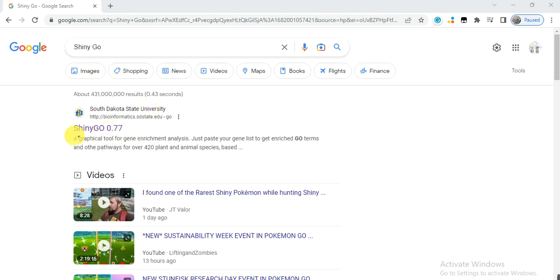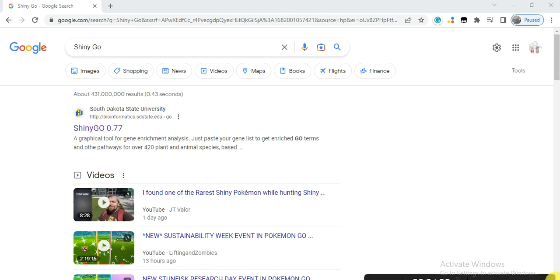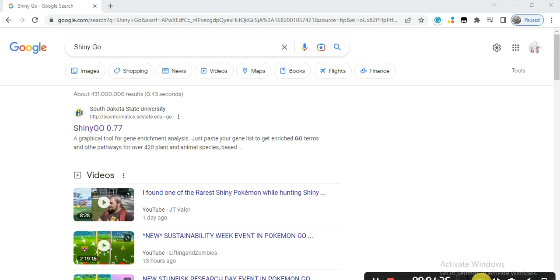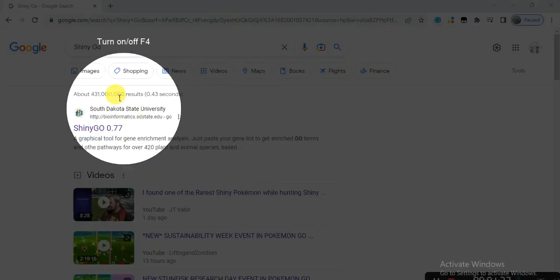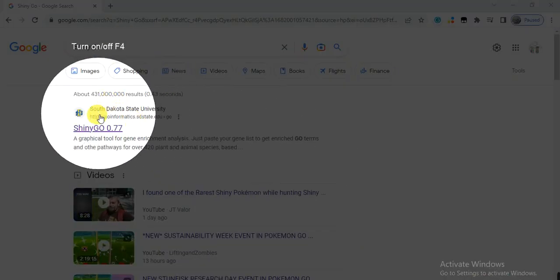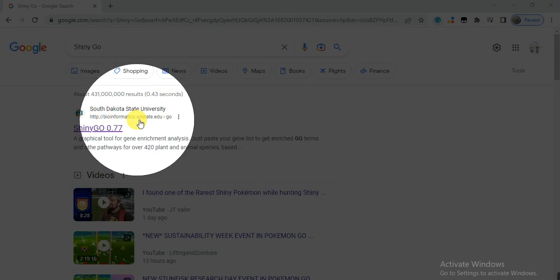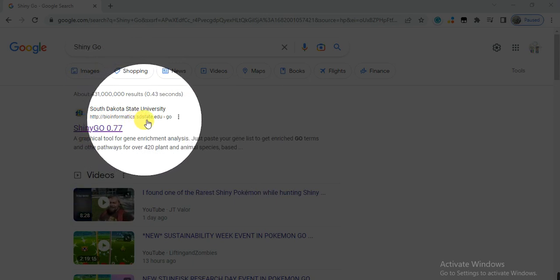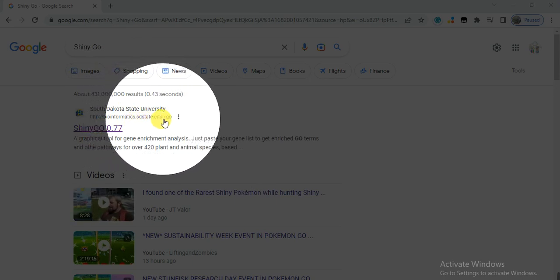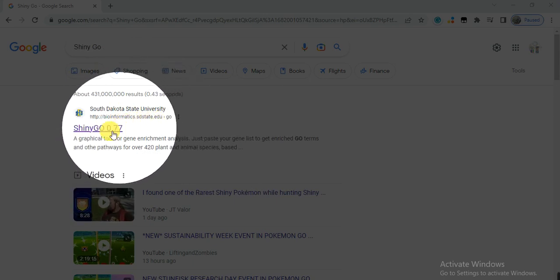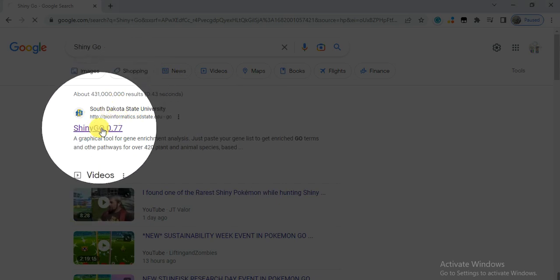When you press enter or click on search, it will give that first link at bioinformatics.sdstate.edu/go. You need to click on it.